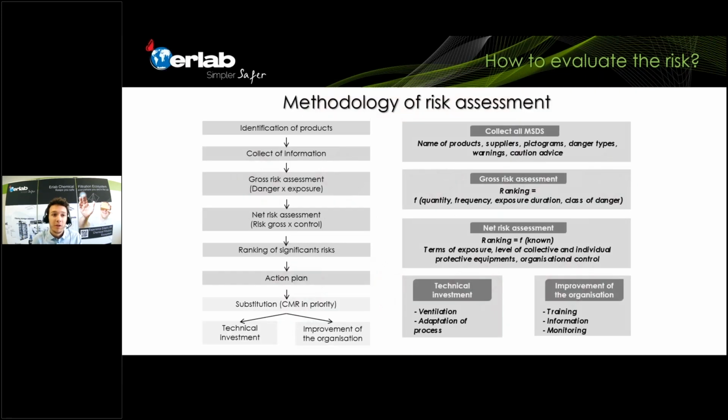And then I would like to talk with you about the methodology of risk assessment. This is quite a busy slide with a few things on it, but let's start on the left of the slide. It's a methodology to look at what risks are still present in the lab, which risks have we eliminated, which ones are still there, and for which ones do we still have to find the appropriate solution?